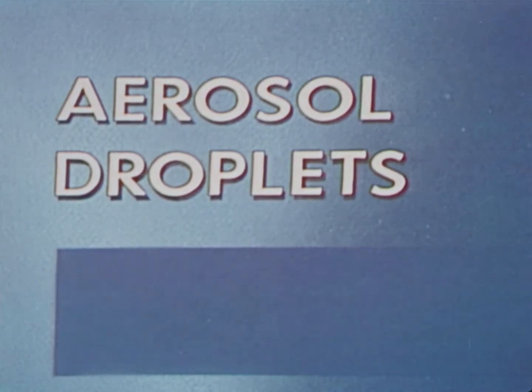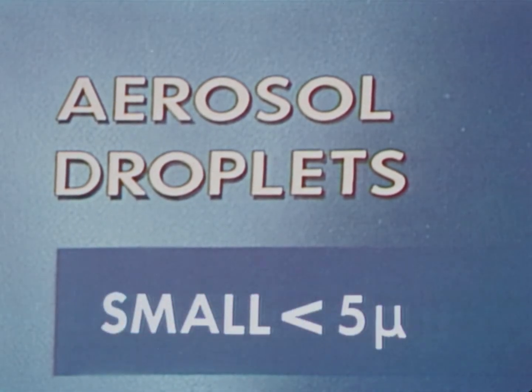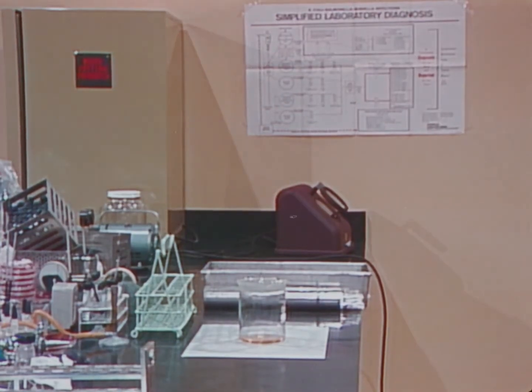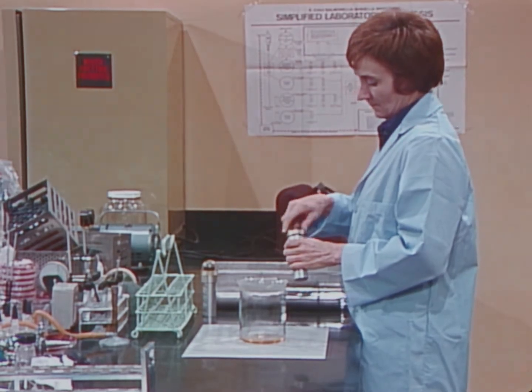In identifying aerosols produced by routine procedures as principal contaminants of the laboratory environment, two distinct forms have been described. One kind of aerosol is primarily composed of large droplets, larger than 5 microns. The second kind of aerosol consists mainly of droplet nuclei. These are tiny, solid particles whose usual size is less than 5 microns. The two forms of aerosols contaminate the laboratory environment in contrasting ways.